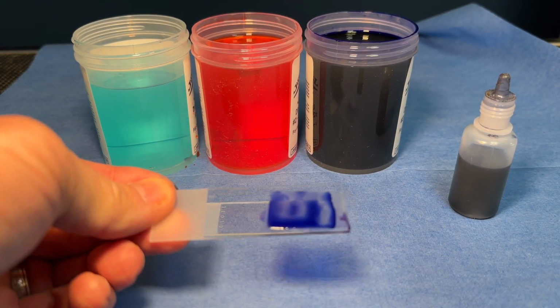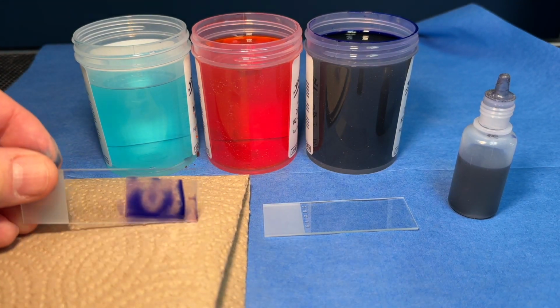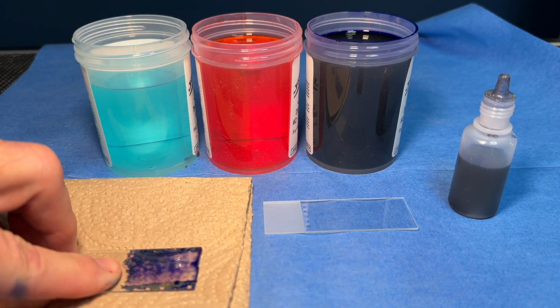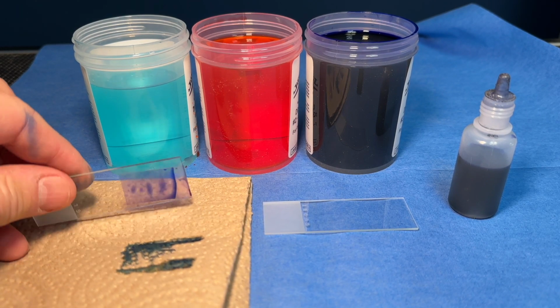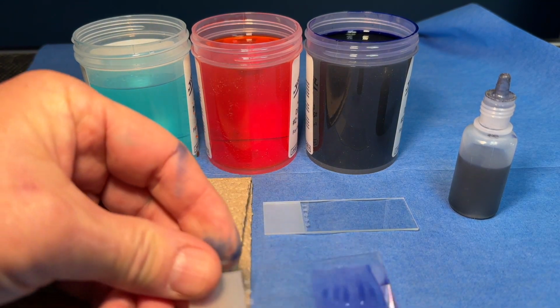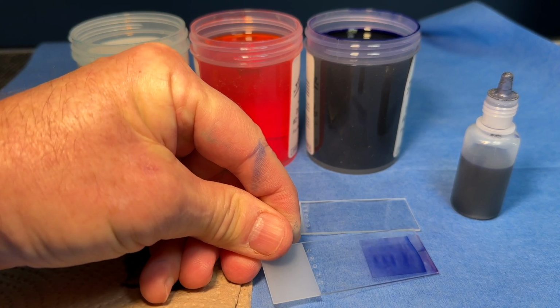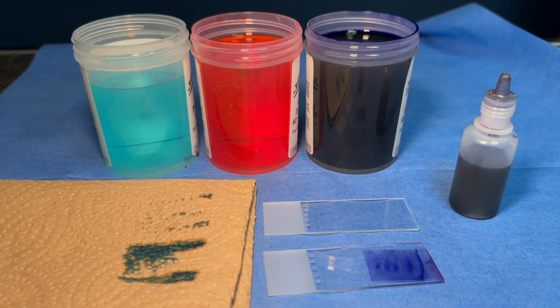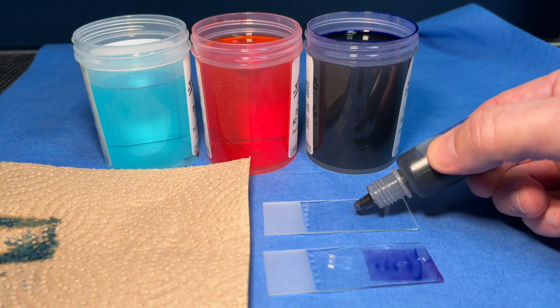The excess stain can be dabbed off with a paper towel by inverting the slide and applying pressure. You can see how messy this technique is by the stained fingers. Way too often, cytology is not collected and examined under the microscope because of the labor-intensive and messy nature of the process. A much better technique can be developed, which is quick and just as accurate with much less effort and time.